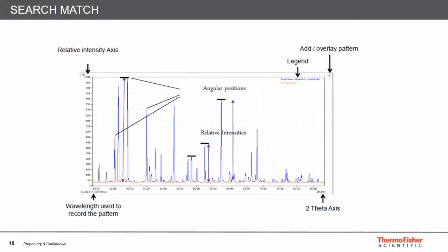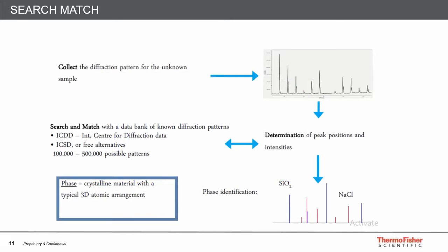For regular powder diffraction and inorganic, you don't really want amorphous. That's not great, but you're going to get it. So again, what we do is we run a pattern. We identify what we see in the pattern. So we basically mark the peak positions or have the software automatically do it, mark the background, and then we use a database that has a spectral library and compare that database to what we just collected.